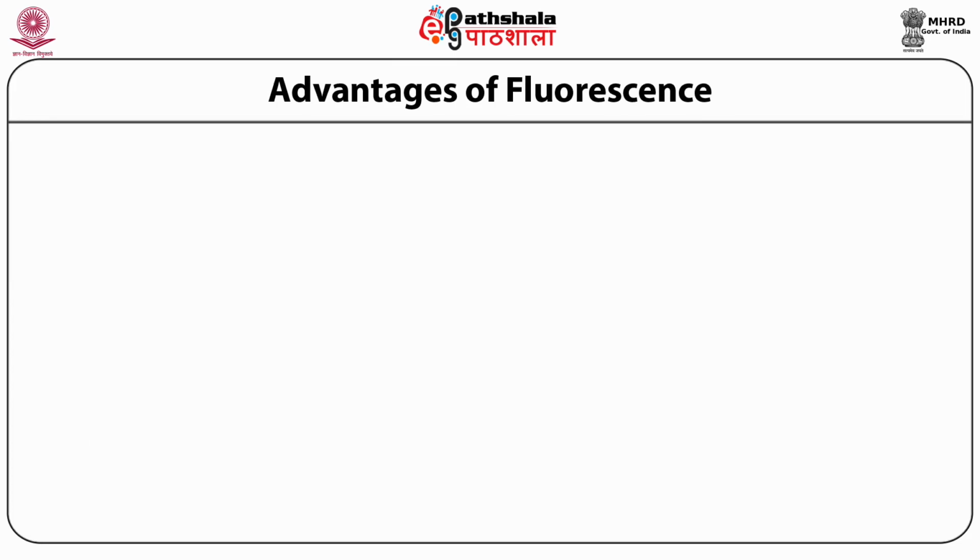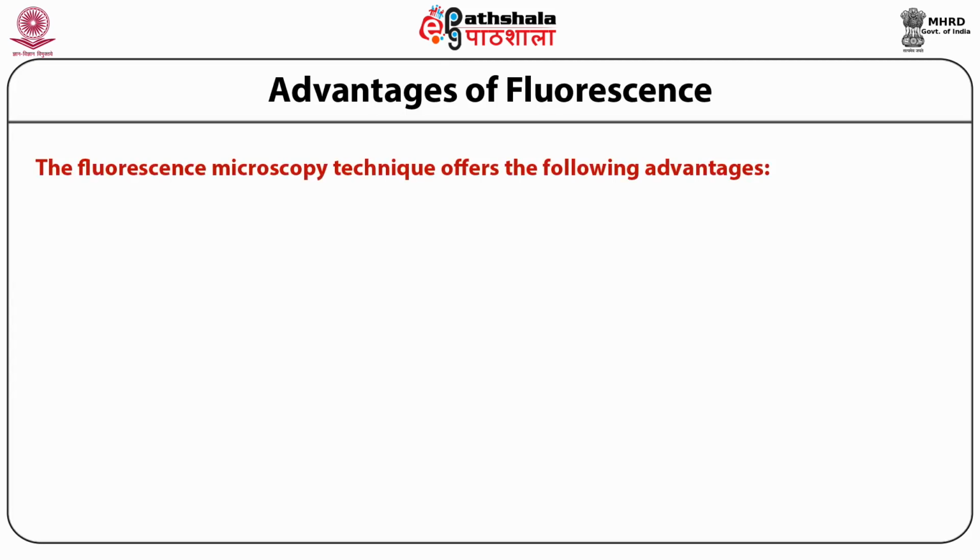Let us now discuss the advantages and limitations of fluorescence. Let us first see the advantages. The fluorescence microscopy technique offers numerous advantages. The first one is that the signal to noise ratio is very high. That is because of the black background.